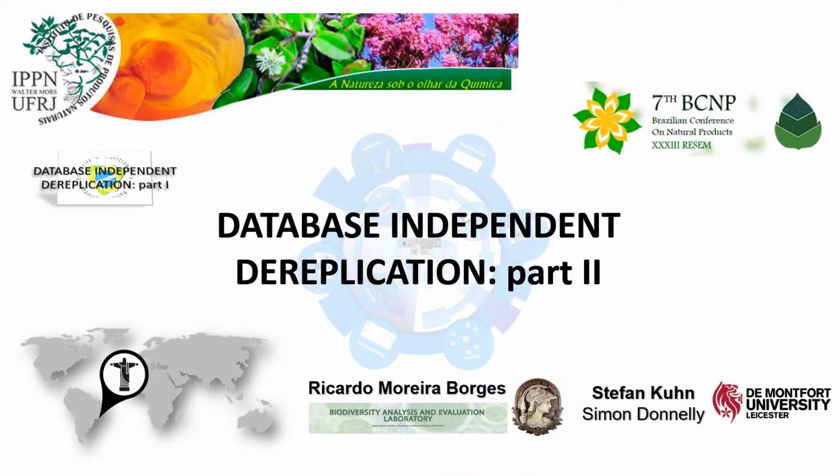Today I'm going to talk about database independent dereplication. I'm calling it part 2 in the title because the first part was the theme of my last talk at the BR Mass in December last year, 2018 in Rio, about the mass spec side of it. Today I'll be focused on the NMR side of the method I'm presenting.